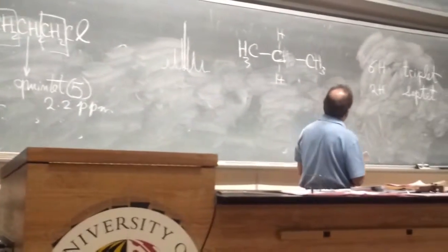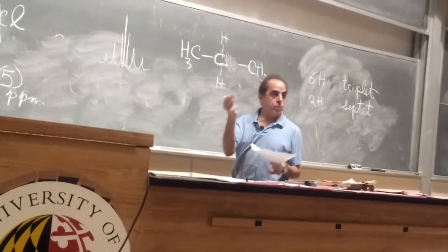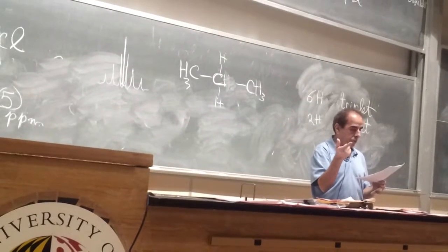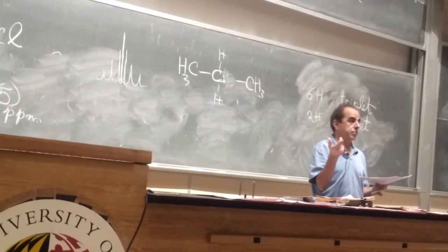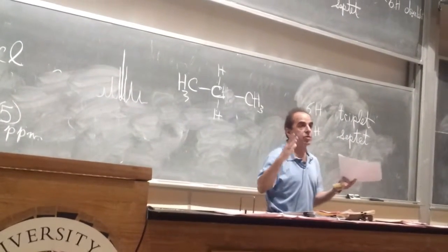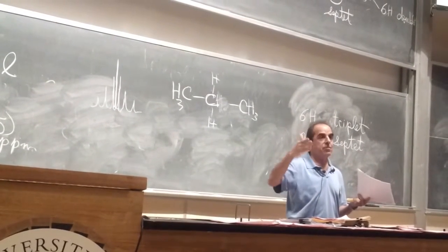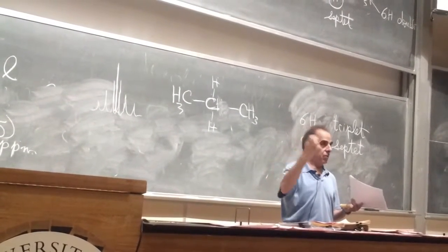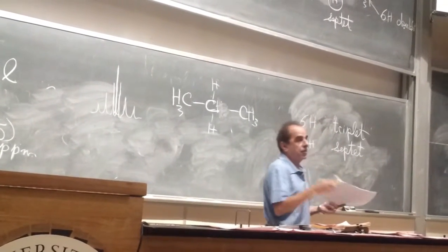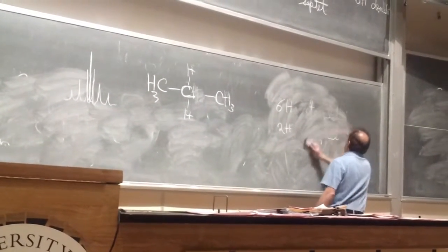Let's take a look at another spectrum. So what do we know so far? We know the ethyl group. We know the isopropyl group. What about a propyl group? Let's see if I have a propyl group. That would be a good one to look at, right? Because in NMR, you get the original formula and you're trying to figure out, by the multiplicity of the signals, what kind of groups you have. And then you put them together for it to make sense. And of course, we use chemical shifts as well as integrations to figure it out.